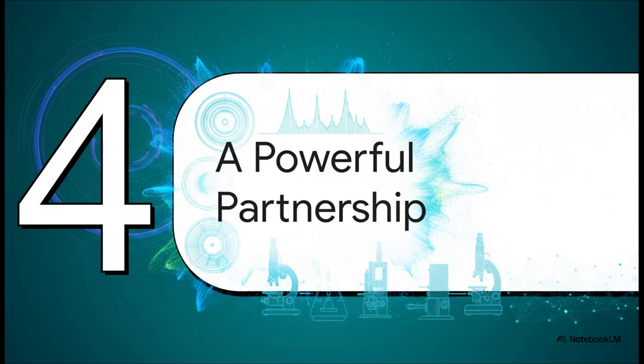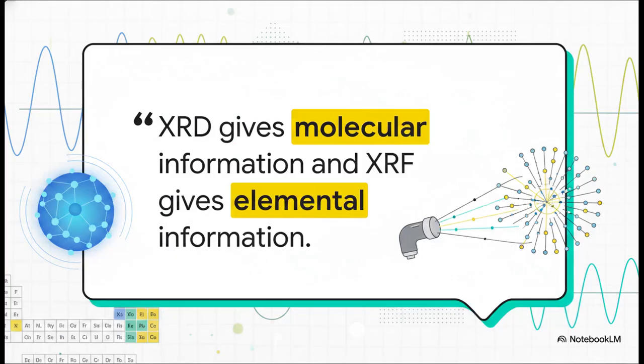So, after all that, you might be sitting there thinking, okay, so which one's better, the architect or the chemist? And the answer is neither. This isn't a competition at all. The real power, the most complete picture, comes when you actually use them together. There's a quote that sums this whole thing up perfectly. XRD gives molecular information, and XRF gives elemental information. I mean, that's it, right there. One is the list of ingredients. The other is the set of assembly instructions. Put them together, and you get the complete story of the material.